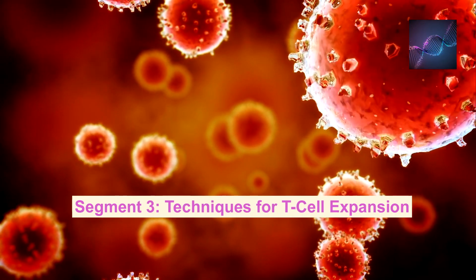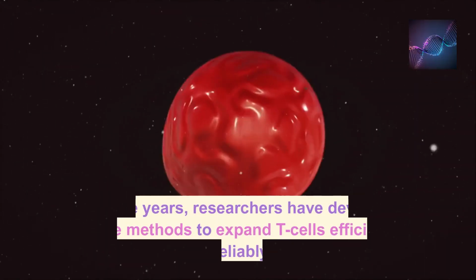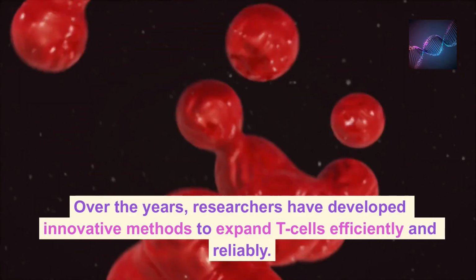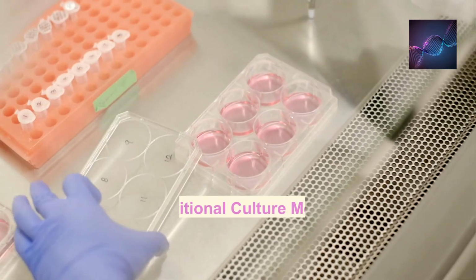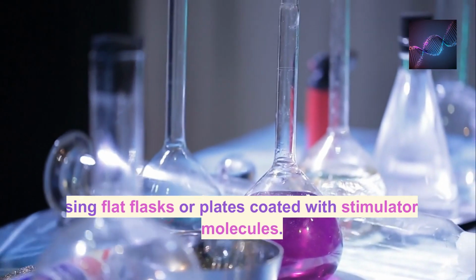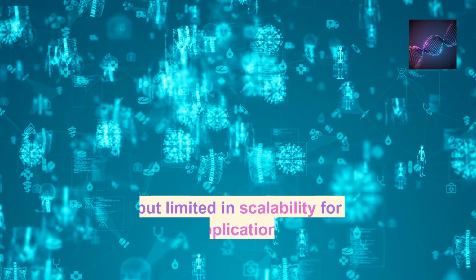Segment 3. Techniques for T-cell expansion. Over the years, researchers have developed innovative methods to expand T-cells efficiently and reliably. 1. Traditional culture methods, using flat flasks or plates coated with stimulatory molecules. Simple but limited in scalability for clinical applications.